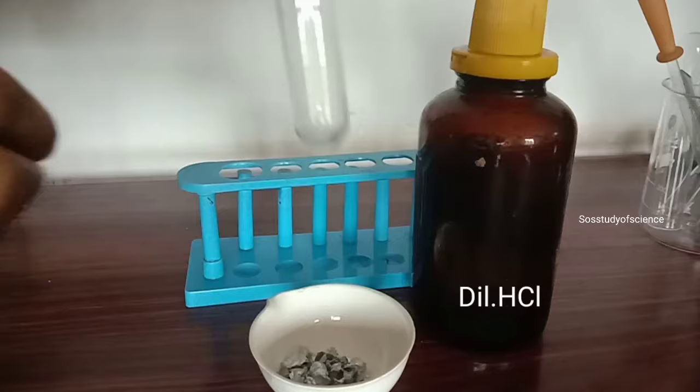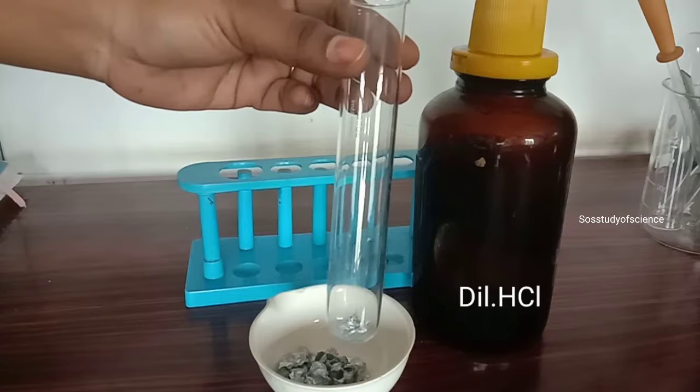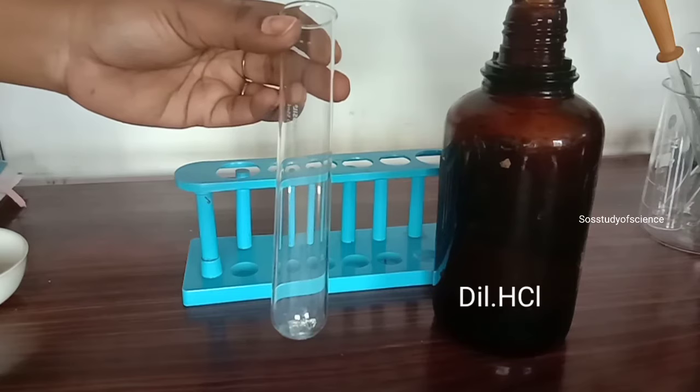Dilute hydrochloric acid is mild in nature, so you can hold the test tube in your hand. Now add dilute hydrochloric acid drop by drop into the test tube.